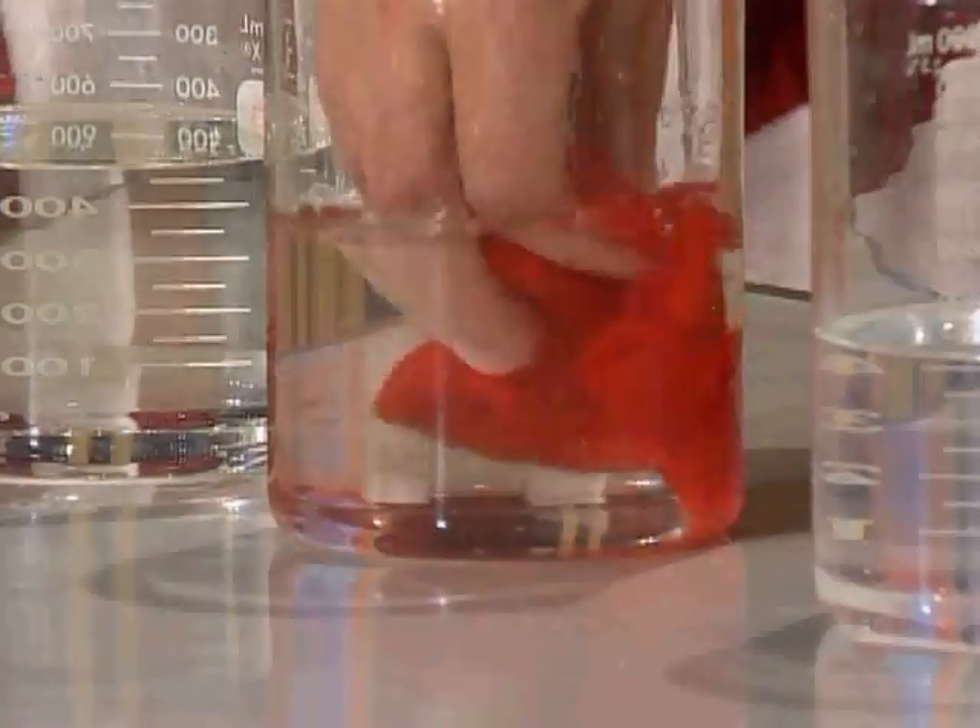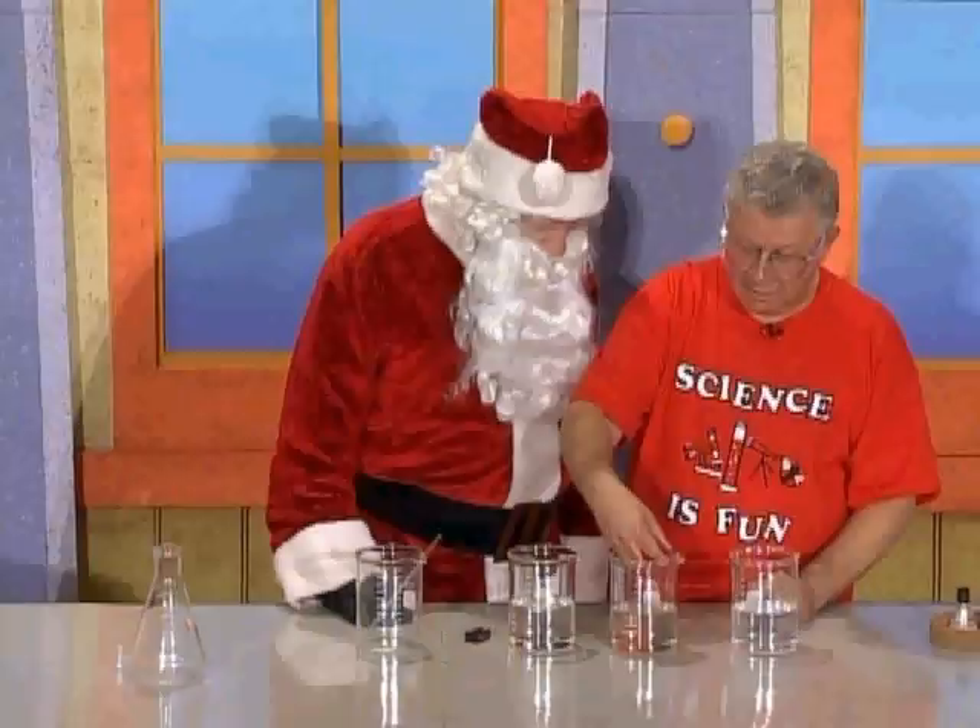Wow, it's nice and red again. But the blue is still in there — I'll show you. I'll just take it out and rinse it in here.